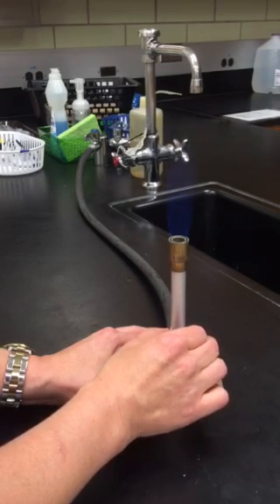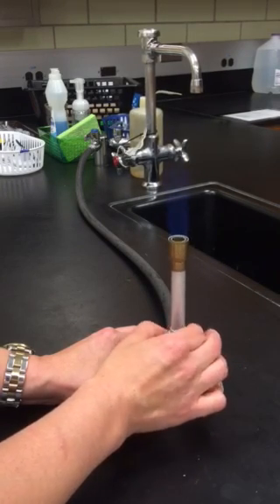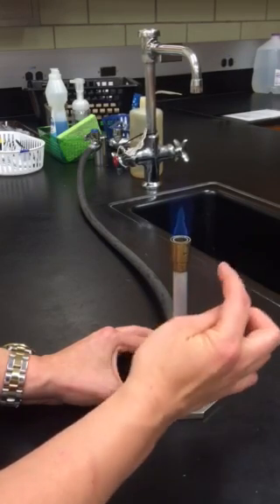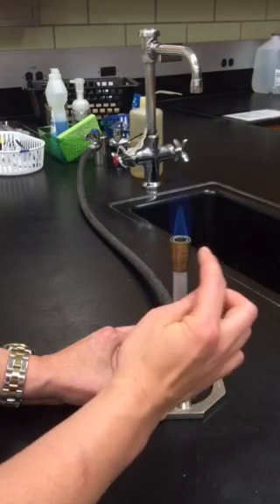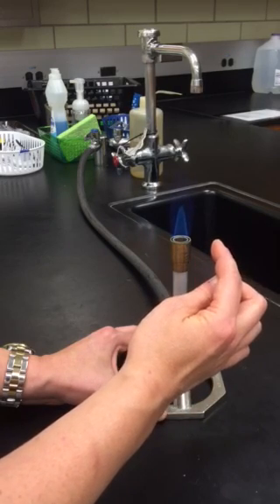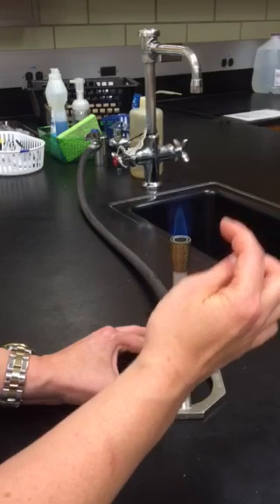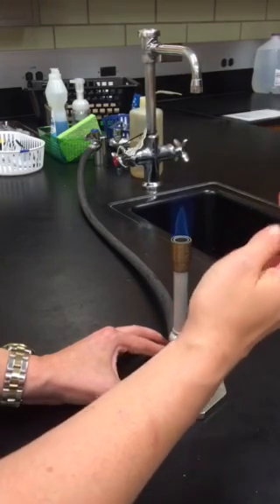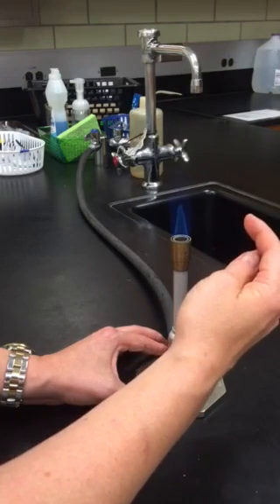I want to keep twisting this left until I get a nice crisp cone within a cone. You see a very bright light blue pointy inner reducing cone, and outside of that is the more invisible, sort of darker blue outer oxidizing cone.